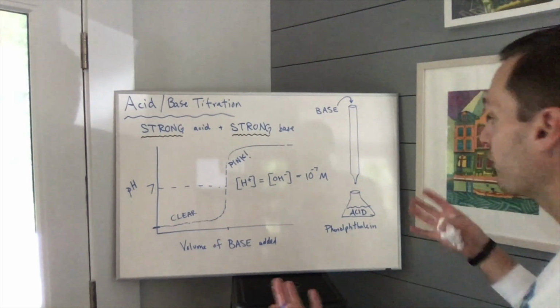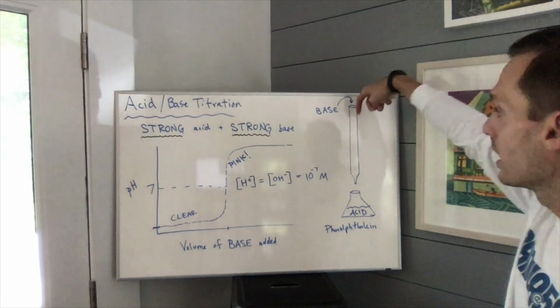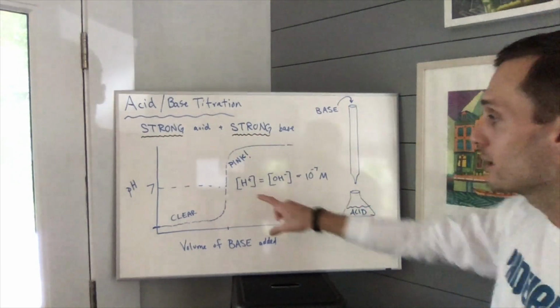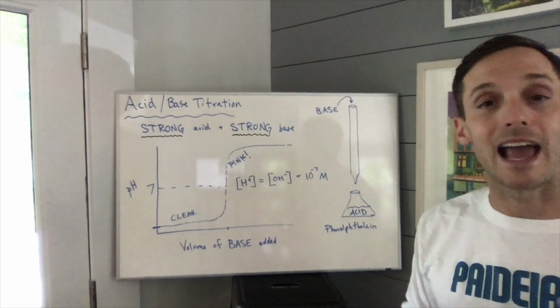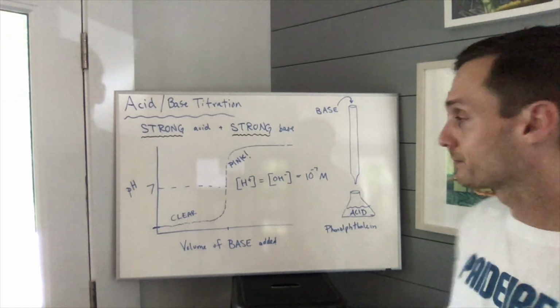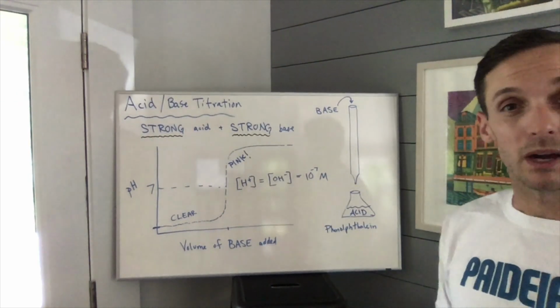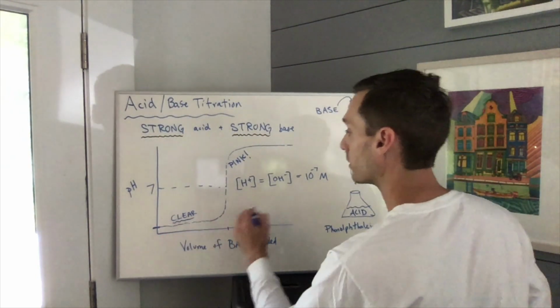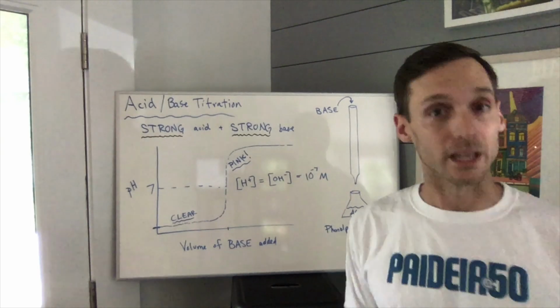We are going to figure out how much of the titrant you need to drop into the flask in order to reach this end point of our titration. And we'll know this just by qualitatively watching the indicator turn from clear to pink.